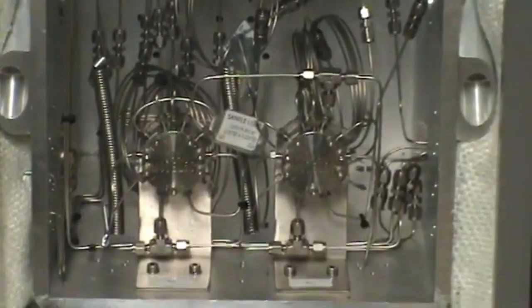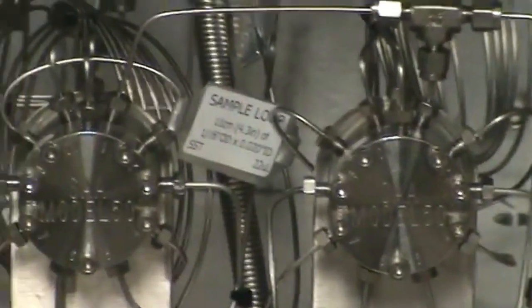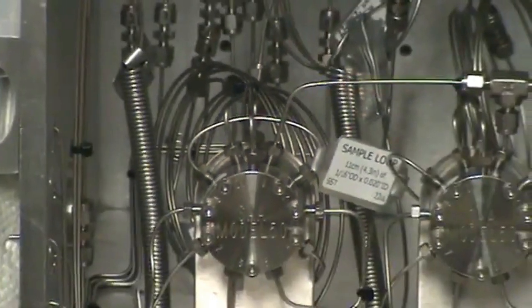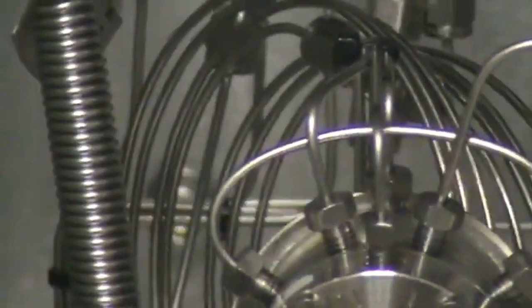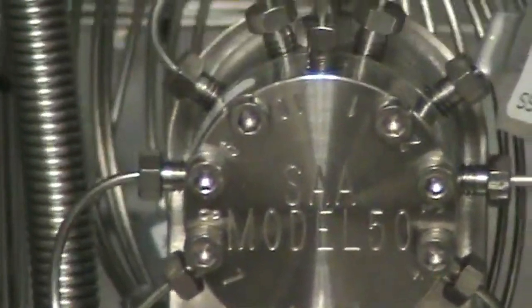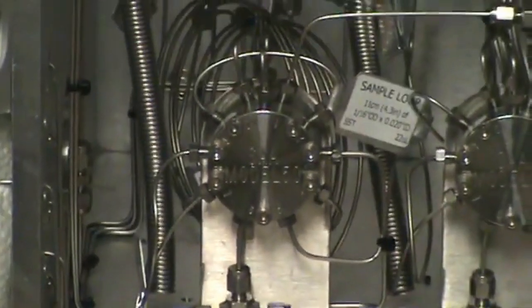All right, so this is this. This is that. That is this. Sample loop. Sample in. Sample out right there. 1, 2, 3, 4, 5, 6, 7, 8, 9, 10. Carrier comes in. 3 to 6. There's our T. 3 and 6.